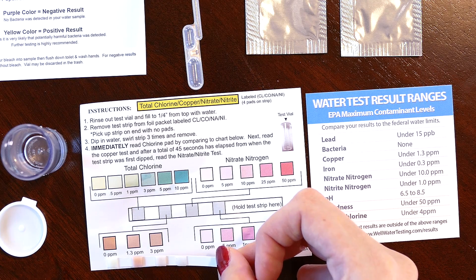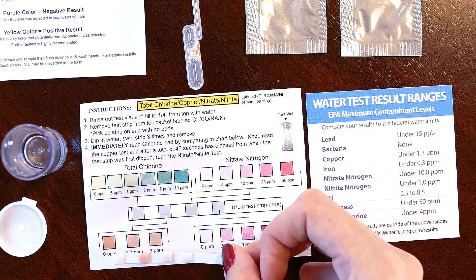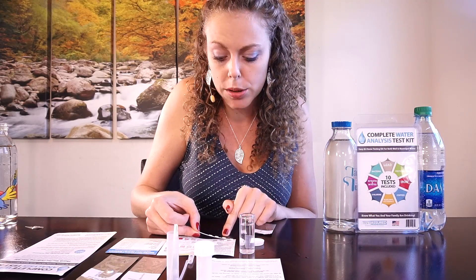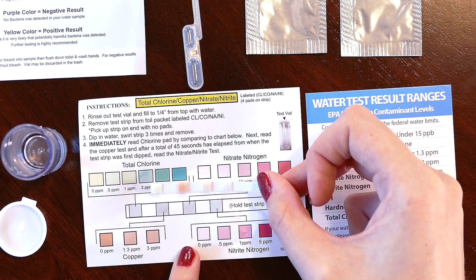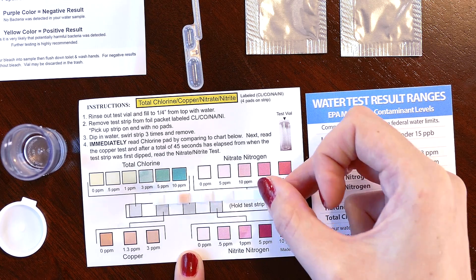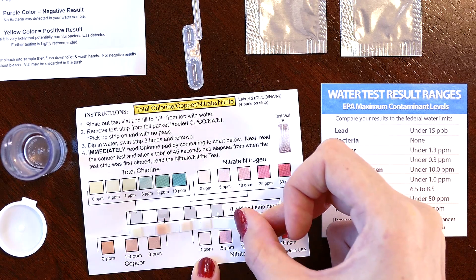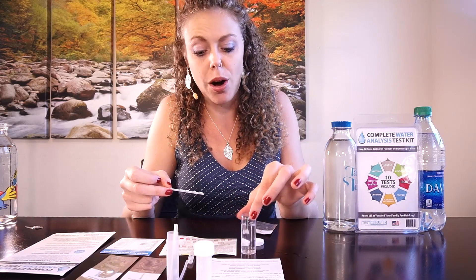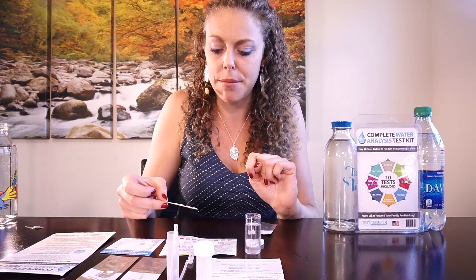For the copper, it could be maybe 1.3 ppm — it's definitely not as orange as the zero reading, but it's just slightly between zero ppm and 1.3 ppm. The nitrate, the third strip, is looking like zero parts per million — it barely has any color. The nitrite, the last strip, is just a slightly off-white, so I'd say zero ppm. I'm going to conclude that this Best Water Factory water had the lowest levels of all these contaminants.